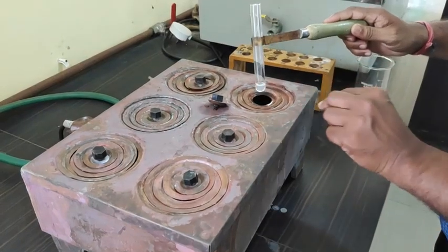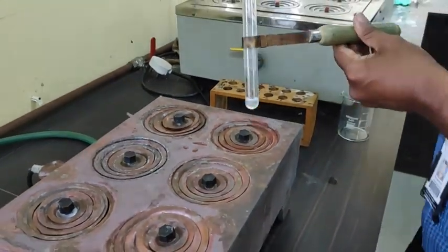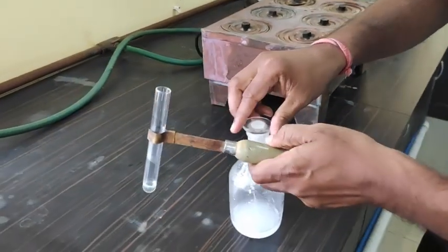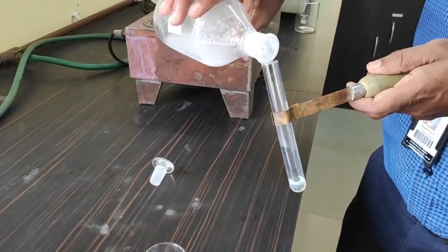Now we have passed 1 minute, and now we can already see that the water bath, which was already on, is now boiling. Now after this, he is adding some amount of lead acetate. Now let's see what happens.